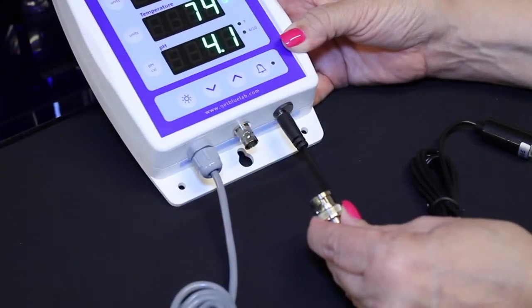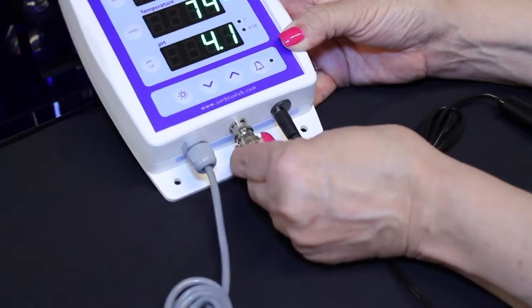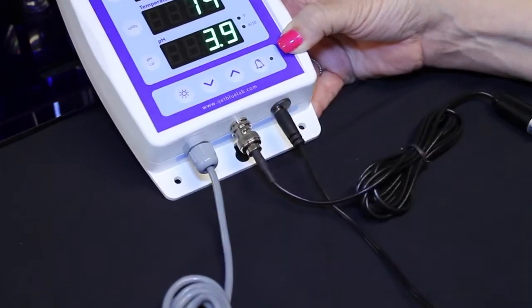Connect the pH probe to the Guardian Monitor by lining up the lugs of the BNC fittings. Fasten securely by pushing the pH probe connector on and twisting one quarter turn.